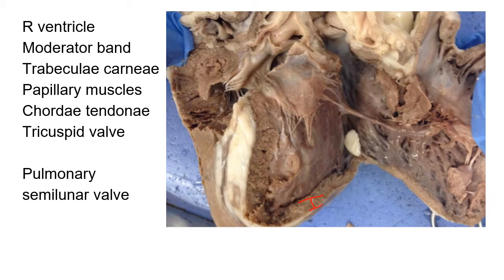The other thing I know that I'm staring at the right ventricle is this band right here. It looks like a band of muscle that goes all the way across. That's the moderator band. The moderator band is part of the electrical conduction system of the heart. So we are bringing action potentials by way of axons across the ventricle to the papillary muscles on the other side. So again, how do I know I'm staring at the right ventricle? Couple of things. The thickness of the wall is your best landmark. And right ventricles will show a moderator band.